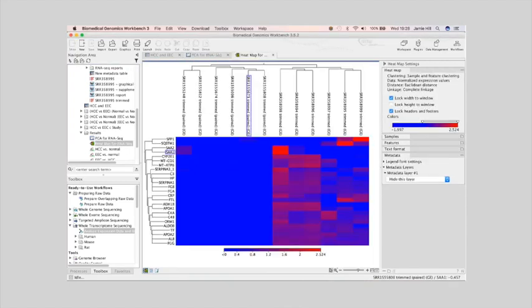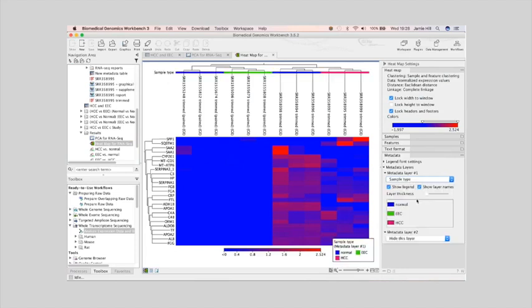Then I can have a look at a heat map. Again, all of the metadata that's associated with these samples is present for visualization, and I can choose to do it by sample type. The heat map has just been asked to pick out the 25 most interesting genes. This is customizable. You can also have it pick out genes that are interesting to you that you know in advance. Then you see that the liver samples all do one thing, and the gynecological samples do another. You can see some old friends here, like fibrinogen down here, which you expect from the liver.